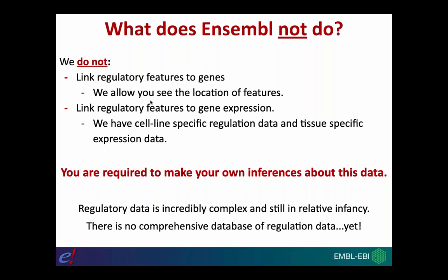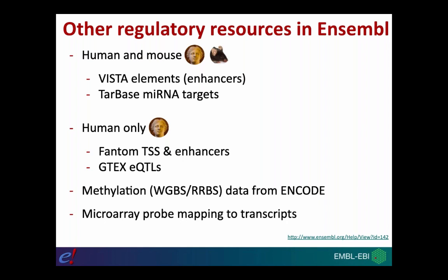We do hope to extend this analysis in the future where we can make these gene-to-regulatory-feature associations, but at the moment our predictive algorithms cannot do this. There are other regulatory resources in Ensembl too: for human and mouse you can view Vista enhancer elements, miRNA targets from Tarbase, and for human you can also view transcription start sites and enhancers from the FANTOM project, GTEx eQTLs, and methylation data from ENCODE. Microarray probes are also mapped to transcripts.